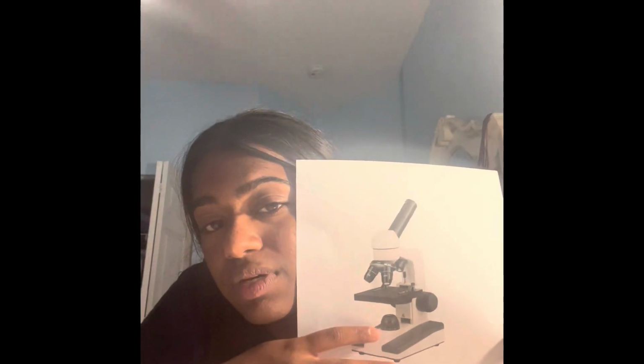This coarse adjustment knob basically changes the focus of your lens so you could see the detailed parts and a much better view of the image. And lastly, this is the lamp. It's also called the illuminator. It's a light that shoots up through the slide, and that way you can see the image.